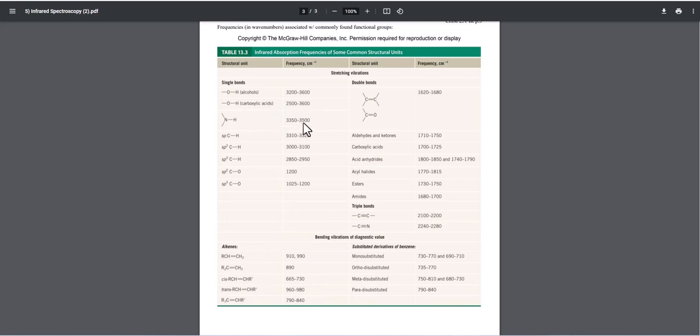So what we see here is infrared spectroscopy is not the most distinct method of identifying what's in the molecule. We kind of already have to know what is in a molecule and use infrared spectroscopy to confirm what's in a molecule rather than use it as a diagnostic tool. So this is usually a confirmation tool rather than something that's diagnostic. But there are distinct regions.